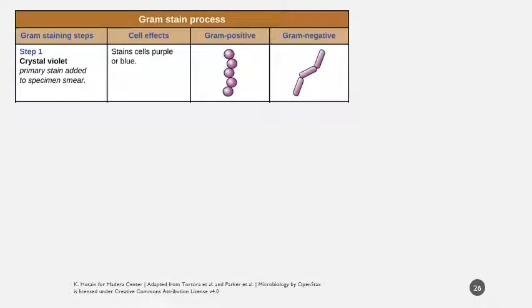So I'm going to walk us through the gram stain process and explain how the dye ends up interacting with gram-positive and gram-negative a little bit differently. I also want to try to do what I normally do on the whiteboard when I'm doing this lecture. So I'm going to have to redo it for each slide, but I think it's worth it.